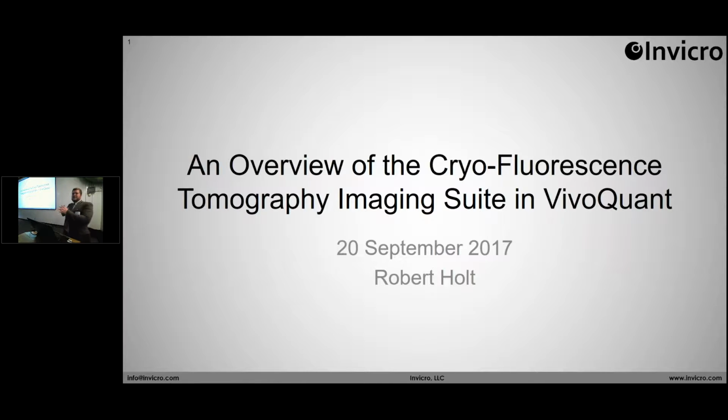Thanks, Mo, for that introduction. So today, an overview of the Cryo Fluorescence Tomography imaging suite in VivoQuant. I know it's a mouthful, but we'll go over it on the slow side, I promise. Before we get into the software tools, I wanted to motivate what we're doing in the first place a little bit.